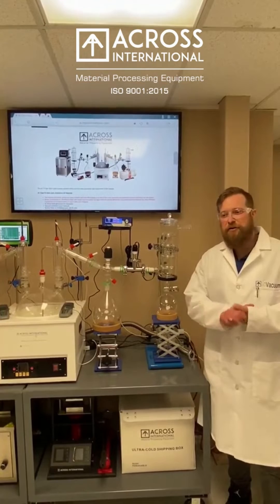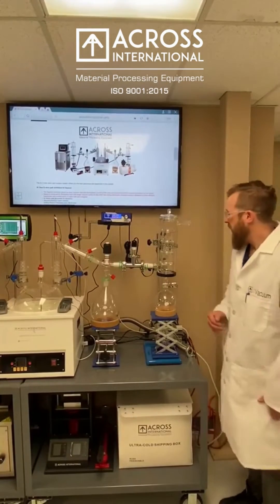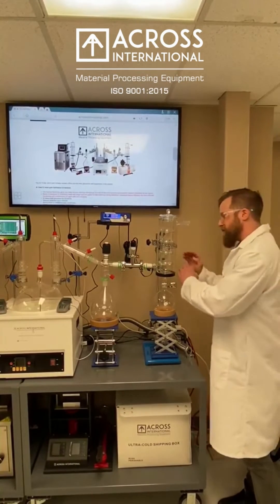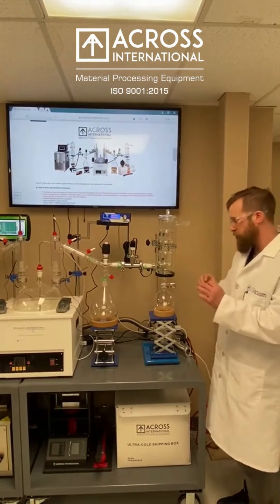Hello, my name is Evan with Across International, and today on Tech Tuesday we're going to talk about optimizing your cold trap. Anytime you're using a Dewar style cold trap, whether it's made of glass or stainless steel, you're going to fill this with dry ice or potentially an Immersion Pro temperature control device.